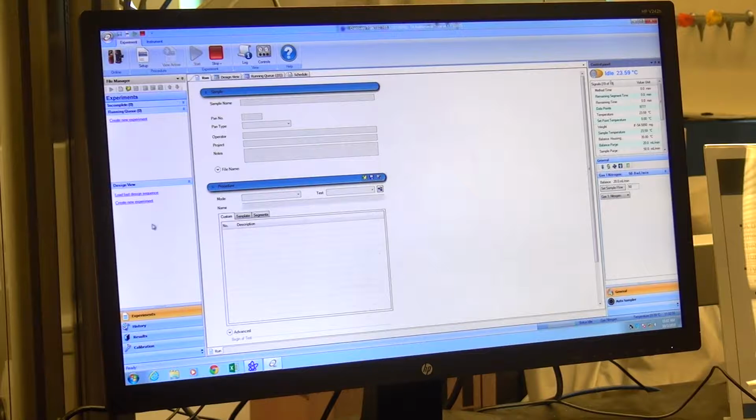All right. This works well because let's say you come in and you're preparing some experiments, and somebody's experiments are still running, or they have one more left, things like that. Or even your own experiments, you put like 3 or 4 of them on here, and you're mixing and matching, and sometimes you get confused. This way, when you do it in the design view, you have a chance to check things over, to do any modifications, and then all you need to do is click and drag it directly into the running queue and place it in whatever position you like it to be in. So that way you don't accidentally interfere with anything that's currently running or anything that someone else has scheduled, anything like that. All right. So if you prepare it in design view, you sort of avoid all of that sort of craziness.